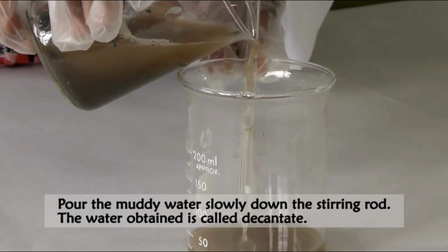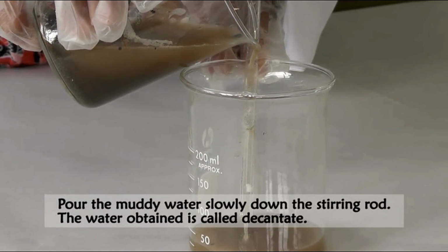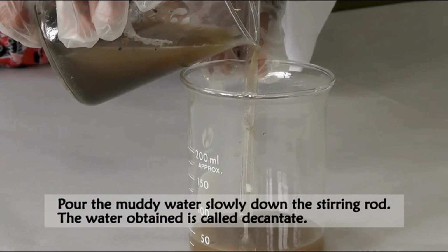Now pour the muddy water slowly down the stirring rod. The water obtained is called decantate.